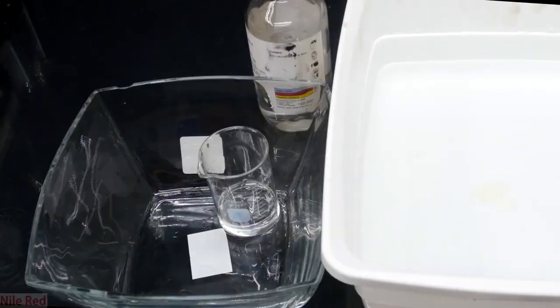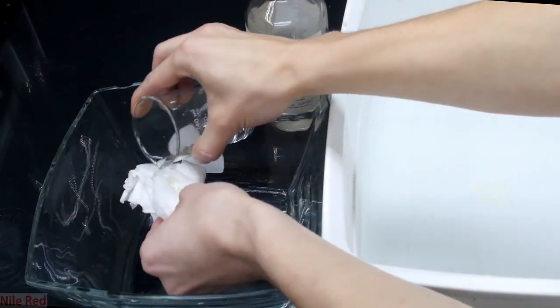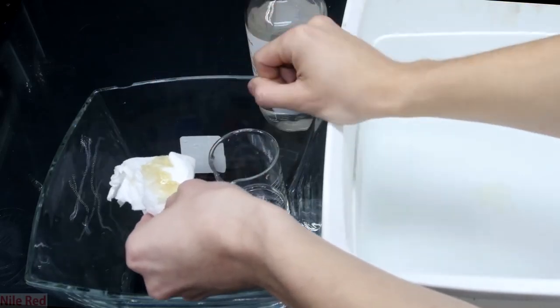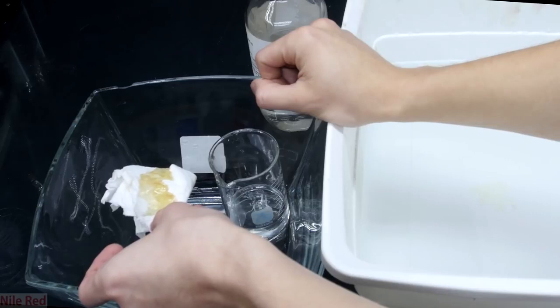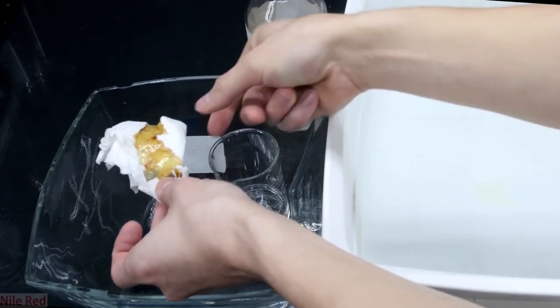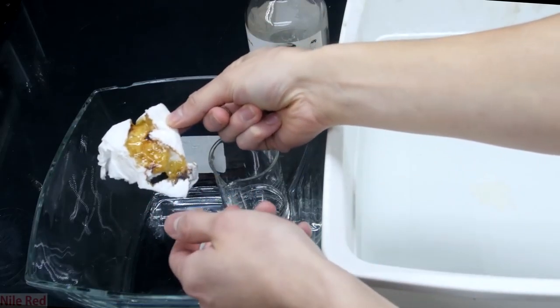And now for the scarier acid, which is concentrated sulfuric acid, and as a quick demonstration, I pour a little bit onto some paper towel. You can see that it pretty quickly reacts with the paper and dissolves it. I didn't hold it here for long enough, but it would only take something like 10 seconds to fully dissolve through a few layers of paper.